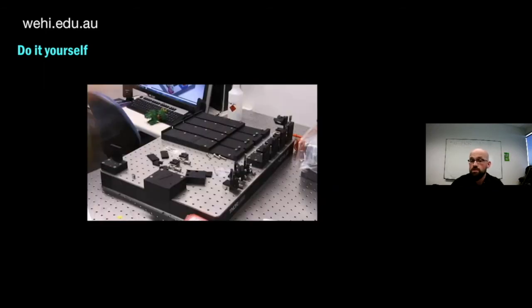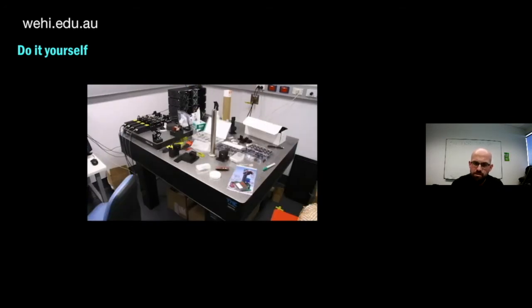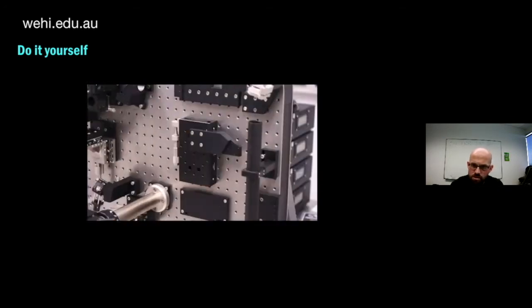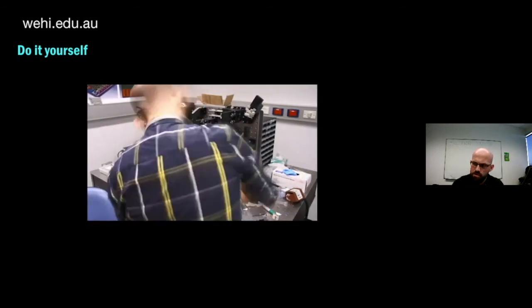So this is what that looks like. Obviously, we worked this quickly. There are some cameo appearances in the middle of this. I think Alan Cowman joins us halfway through and actually screws in a part. I do remember my first few weeks here, every time I passed Alan in the hallways, he wouldn't say hello, he would just say, "Is it built yet?"